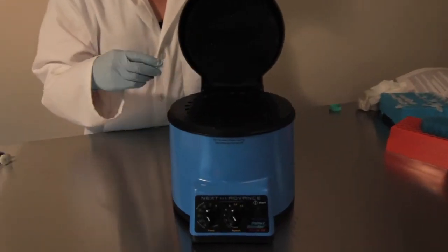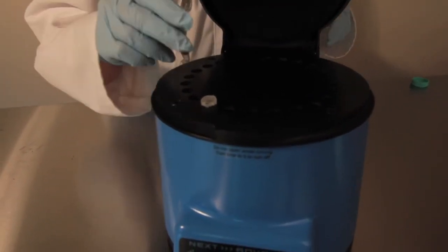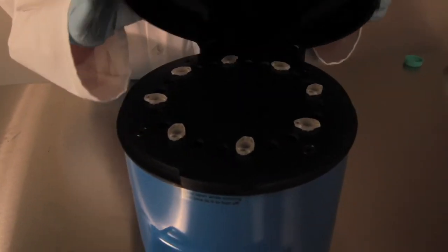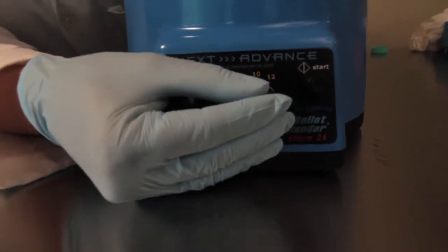Now it's time to make sure that your tubes are sealed tightly and place them evenly spaced inside of the bullet blender. I have eight samples loaded. I'm going to set the speed to eight and the time to three minutes. Close the lid and press start.